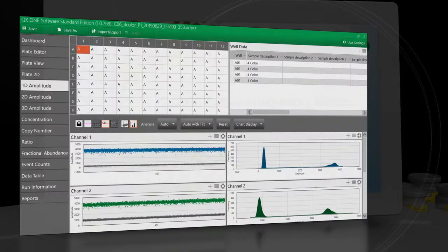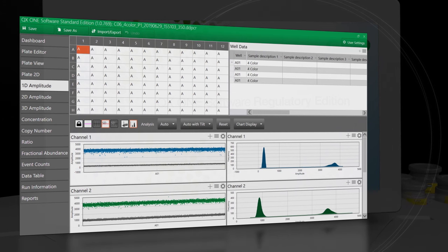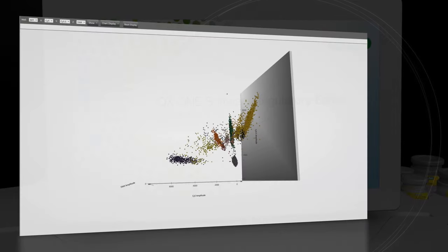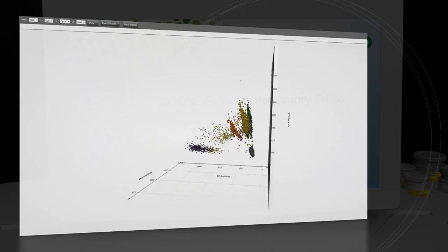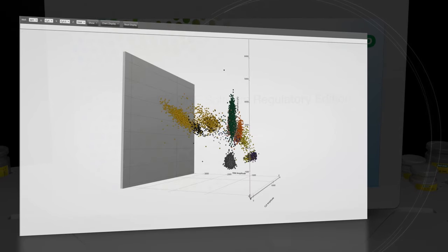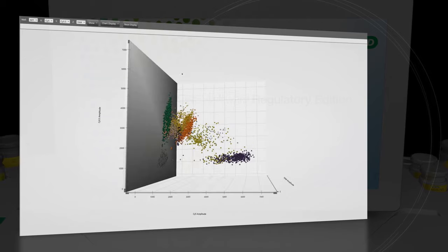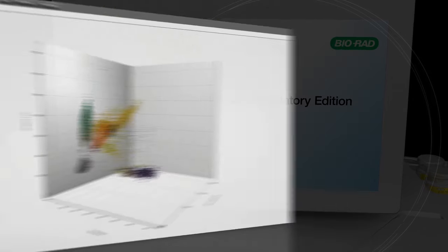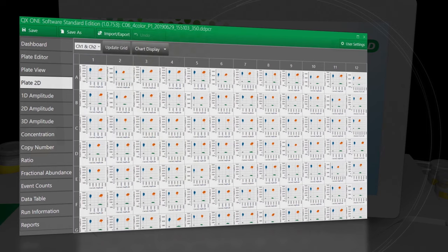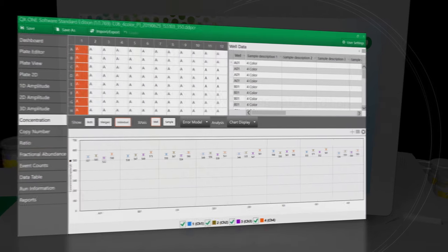The QX1 features complete onboard software support. Data for four-color detection and analysis can be viewed for each well on the newly designed three-dimensional amplitude chart. Two-dimensional amplitudes can now be visualized in a 96-well plate format, and concentration calls can now be made automatically by the QX1 software.